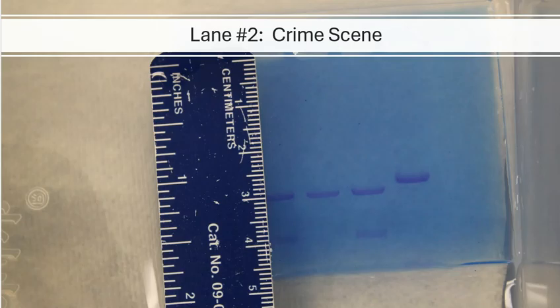I see 2 bands in the crime scene, right? I see one that's present there that shows up pretty well, and I also see a band that shows up here as well. So there are the base pair fragments, different sizes, that showed up at the crime scene. So that person's DNA cleaved into 2 different sizes, and those 2 different sizes separated on the gel, and we can measure how far down they traveled, and that distance is going to be very important.